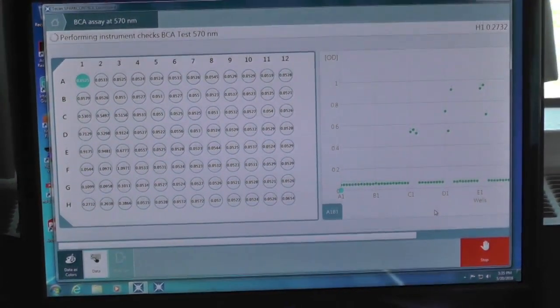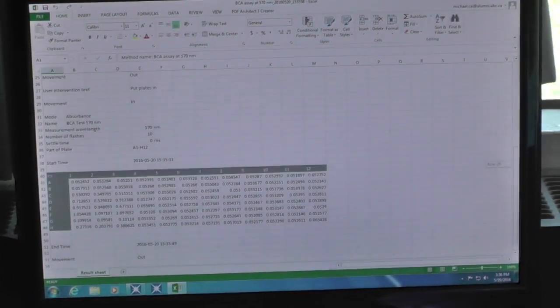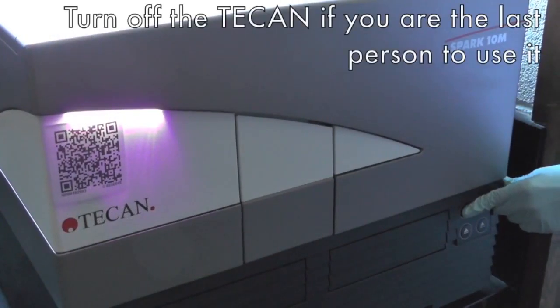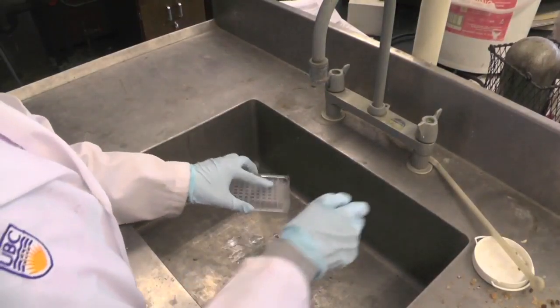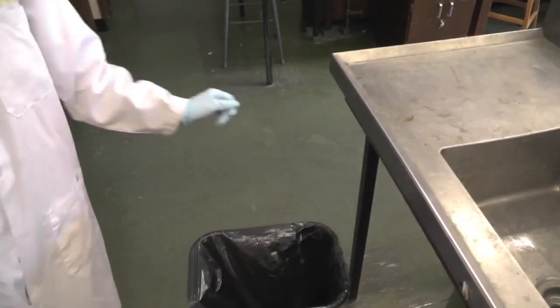Save the result in Excel file with session number and group number on the computer as well as on your USB for further analysis. Rinse the microplate with tap water in the sink, then dispose in the garbage bin.